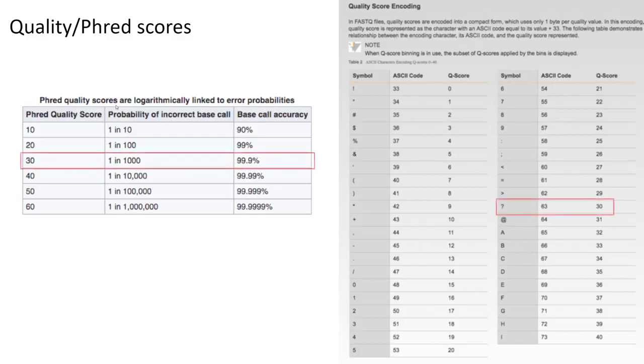So, for example, the question mark character corresponding to the ASCII code 63 here translates to a quality score of 30. A quality score of 30 indicates that the probability that the corresponding nucleotide being incorrect is 1 in 1000 or is 99.9% accurate.